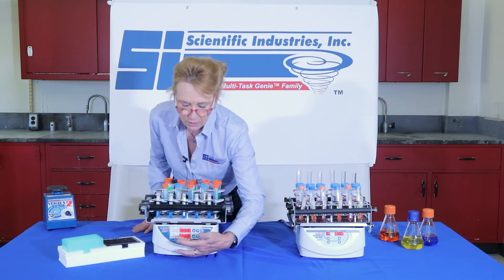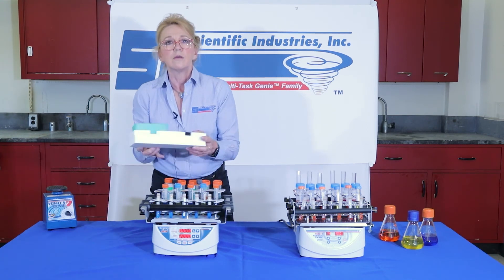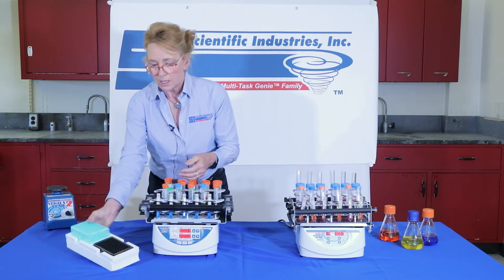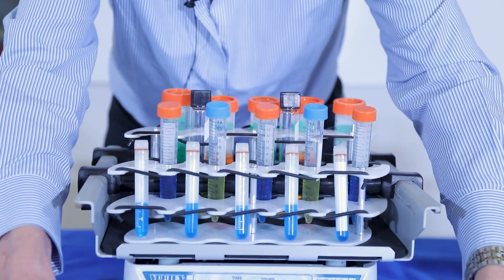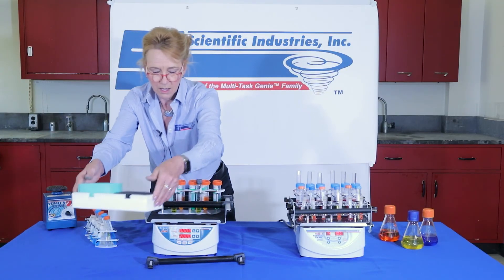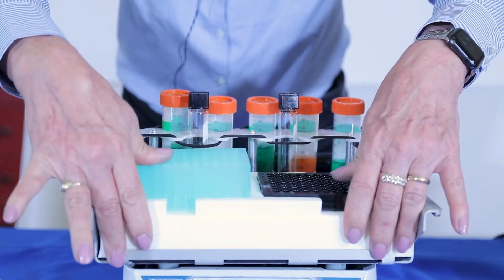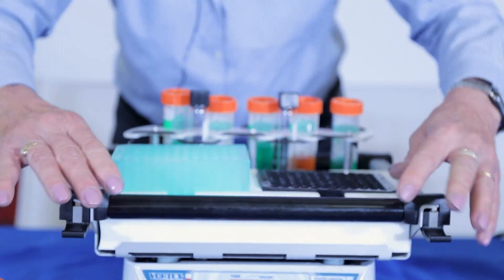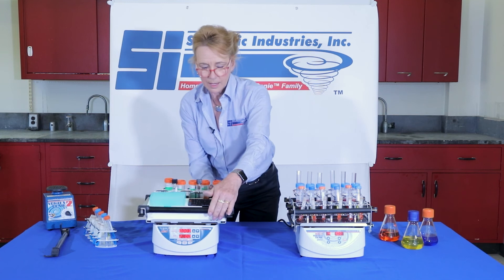In addition to that, we have other capabilities. We have the programming mode here, but we also have the ability to vortex your plates — deep well or standard. It's very simple by just removing the ratcheting rack and setting it aside.